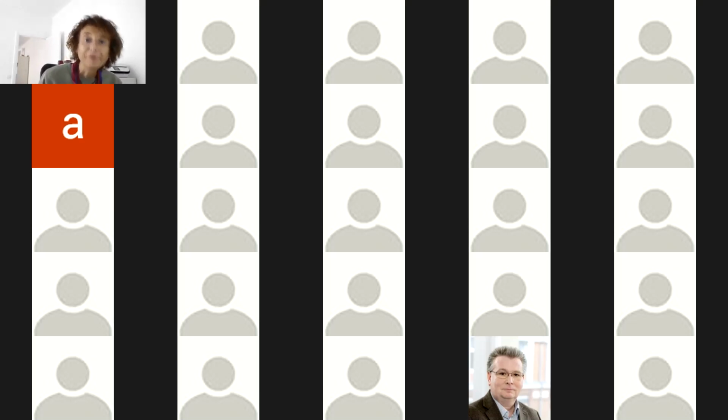So first, we are organizing an interlaboratory comparison whose aim is to demonstrate the fitness for purpose of the optimized and validated methods in the project, both MS-based methods and EBM methods.